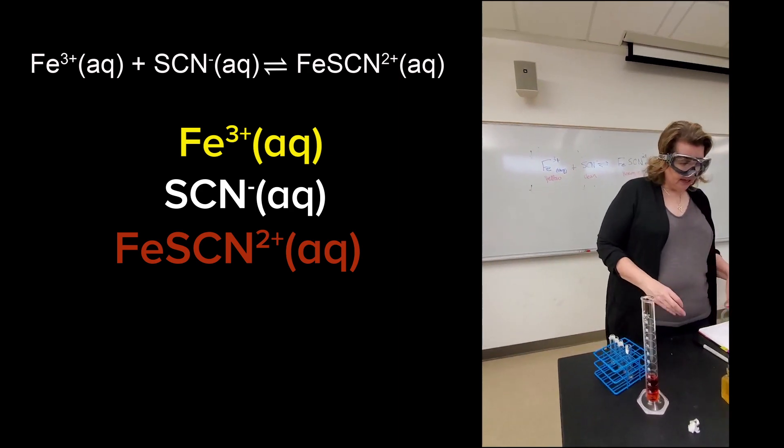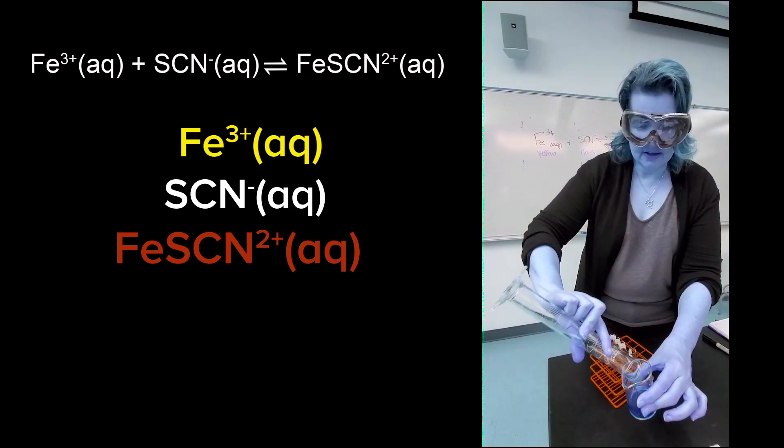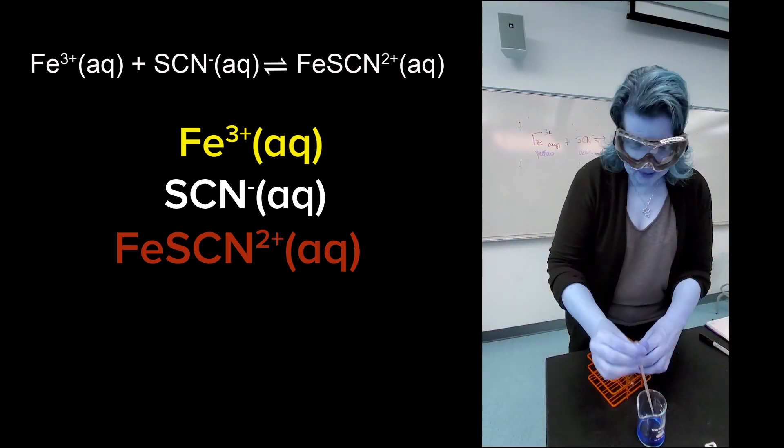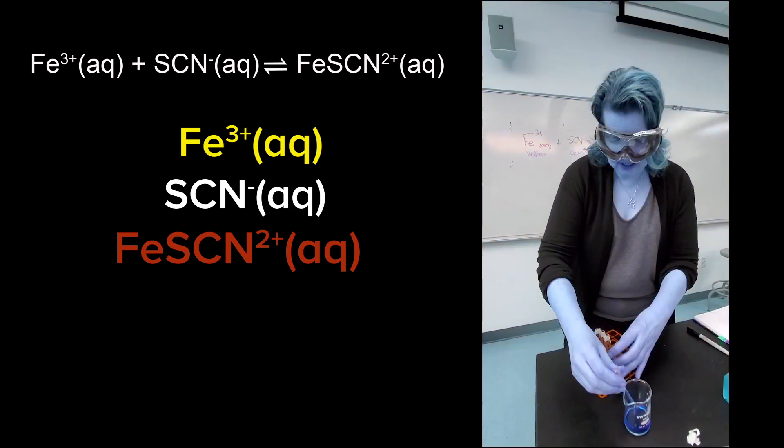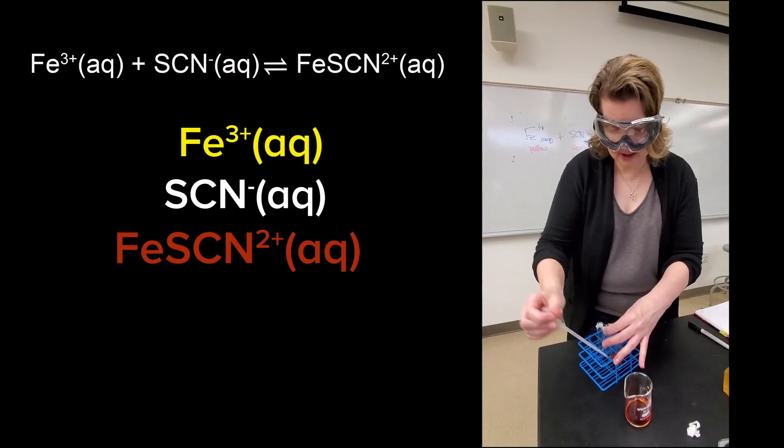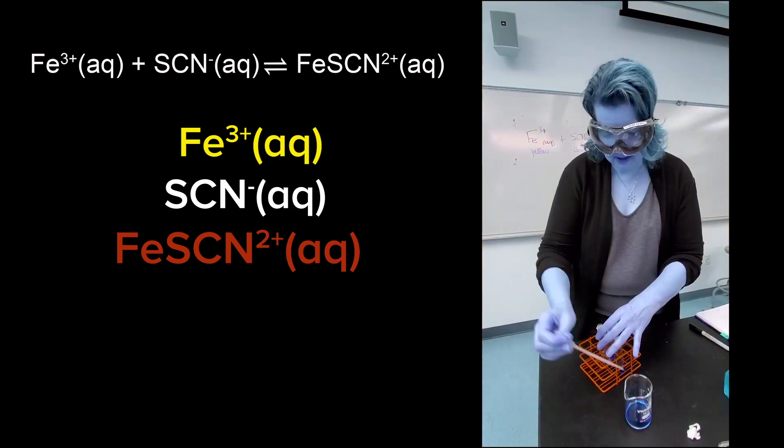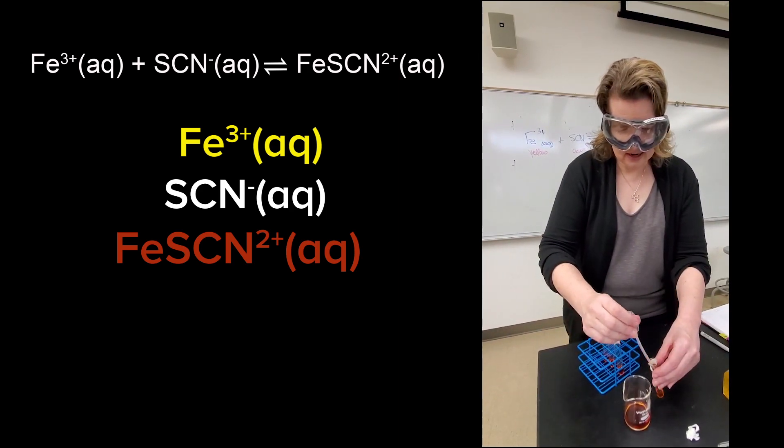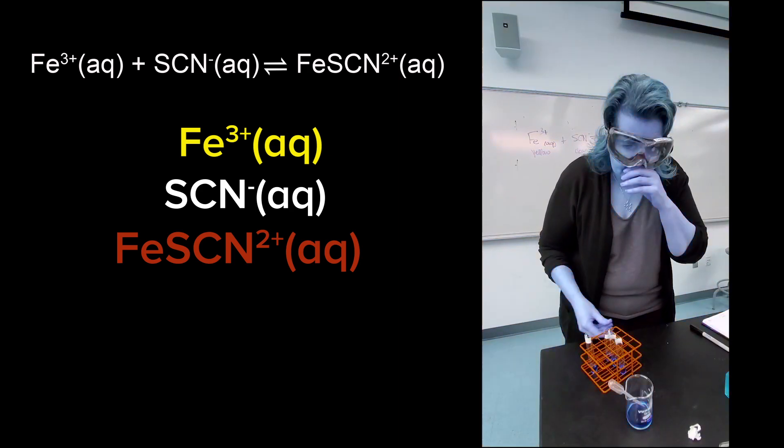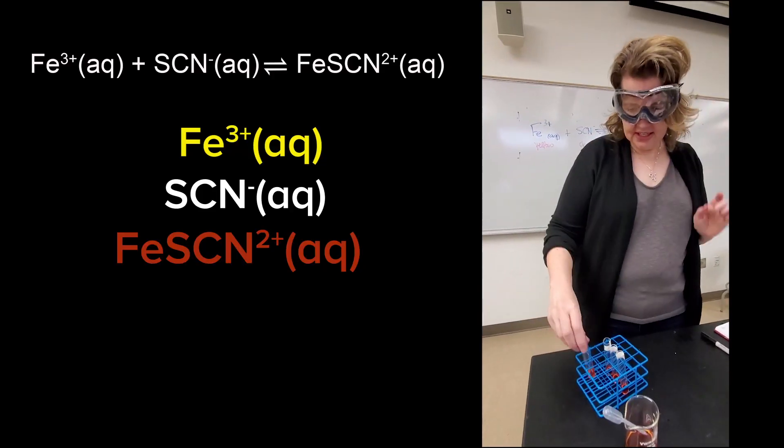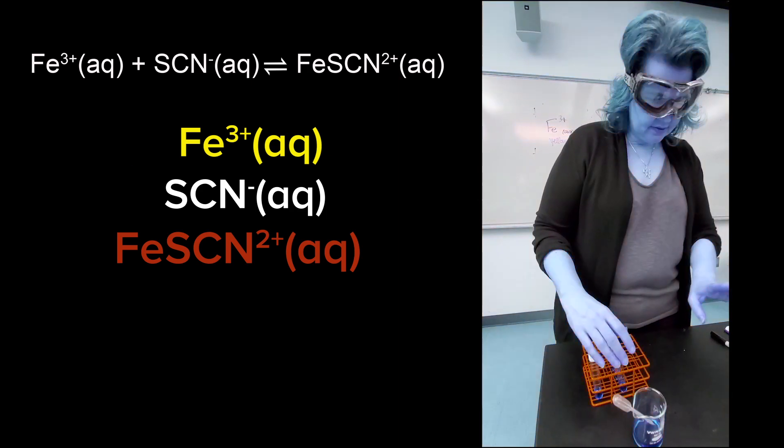So I can use that then to track this position of equilibrium. Now I need to put a little bit of this. Oh, I need to mix this up really well. So I just have a beaker here so I can do that. And I'm going to put a little bit in this solution in each of these test tubes so I can compare. So one of these test tubes needs to stay is my control. Yes. So this is my baseline. This is when I've got this mixture of all together.